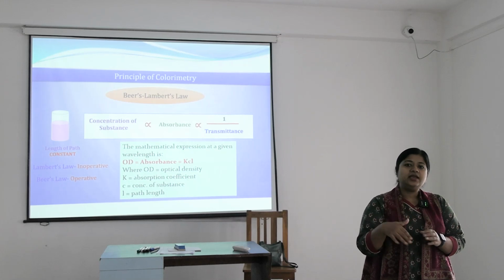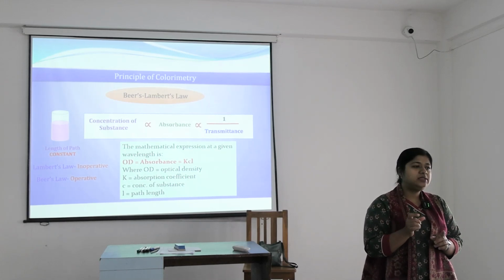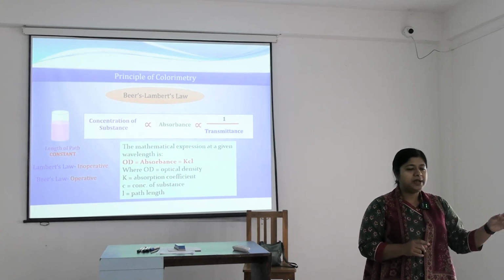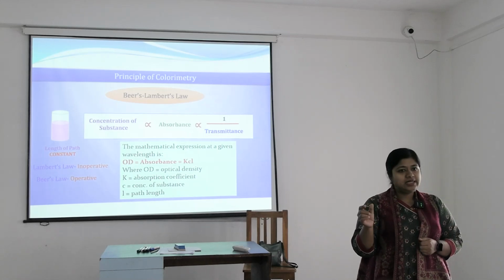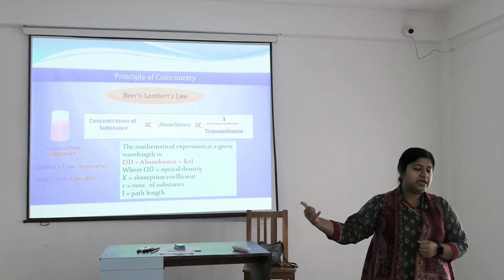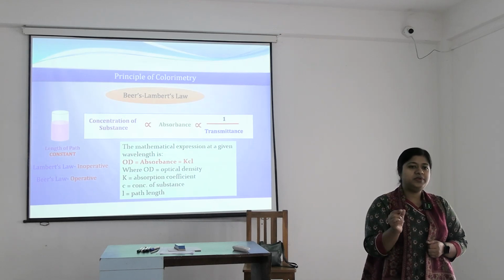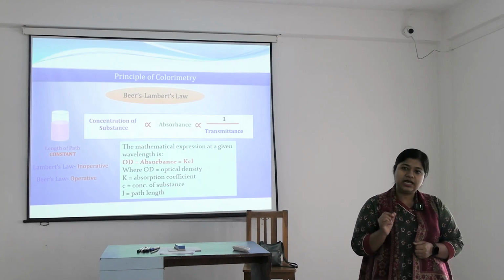So among them, what were the changeable factors? Light we can fix. We can pass a fixed wavelength. Path length we have fixed here, we have kept it constant and it is 1 centimeter. The test tube we use in colorimeter or spectrophotometer is of 1 centimeter diameter.